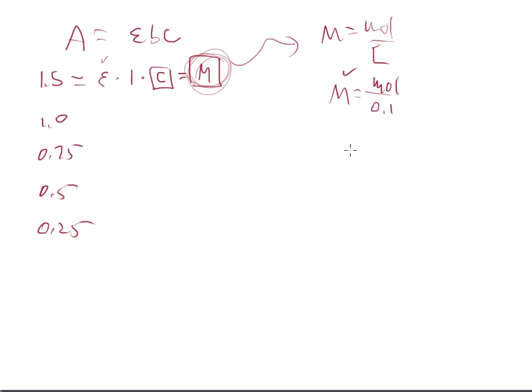So when we solve for this, we're going to solve for moles, and then we're going to have to use the formula weight of caffeine in order to figure out grams, and then we probably need to measure out that many grams. The problem is, what if this is too tiny? What if that's too small of an amount? Like little bitty tiny milligrams, I am not comfortable weighing that out and transferring it and feeling really good about it. So very often we will make a more concentrated version of it.